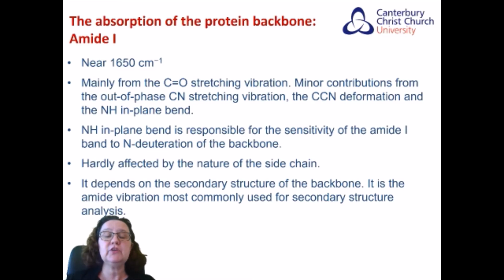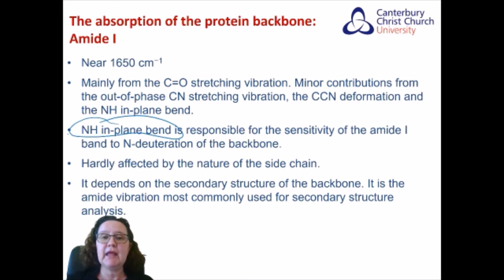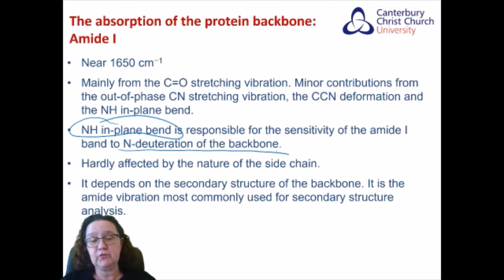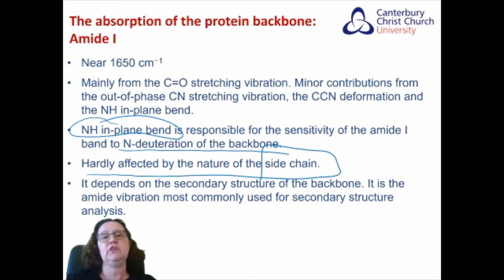Also, although it is mainly due to the carbonyl stretching vibration, it has some contribution of the NH in plane bend. It is sensitive to the deuteration of the nitrogens of the amino groups of the backbone. So it can also be used in deuteration studies, and I have a few examples later on in the video. It is very insensitive to the nature of the side chains, so it is useful specifically to see the structure, the backbone of the protein, and especially the secondary structure.